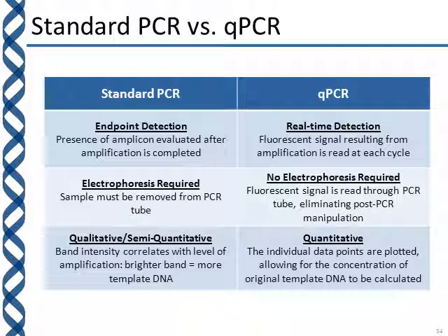And then PCR, the standard version, is considered to be either qualitative or at very best semi-quantitative, because the band intensity does correlate with the level of amplification. So the brighter the band, the more template DNA you had.